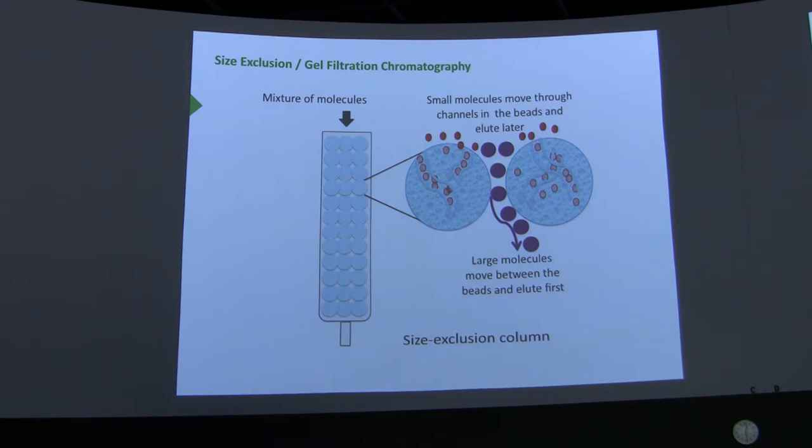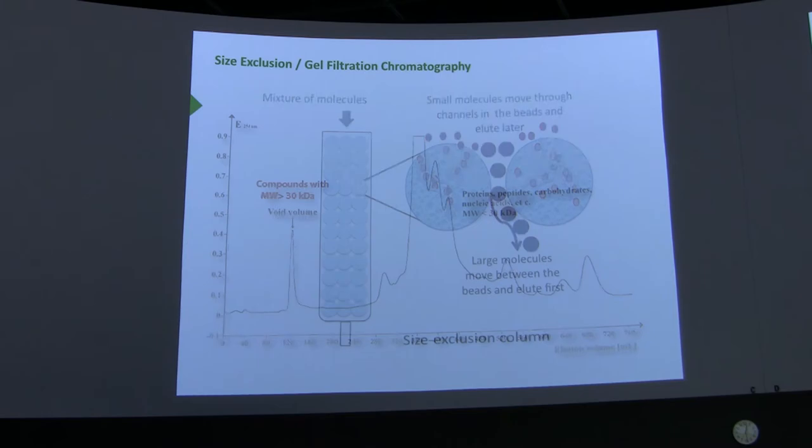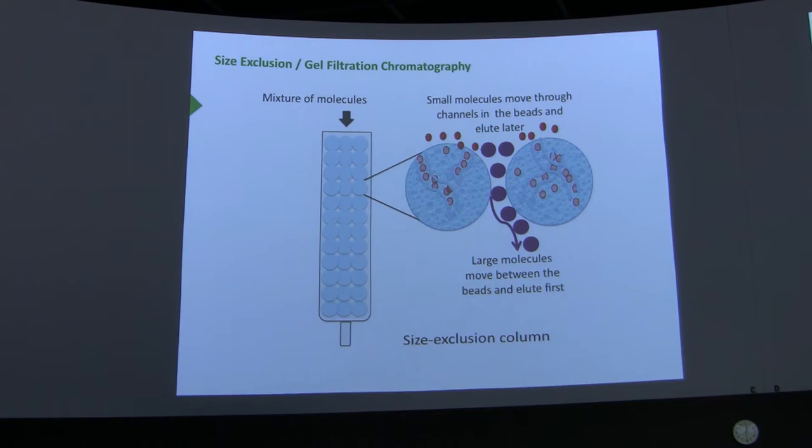All right, they have little tiny openings that come out to the solution so that samples that are dissolved in the buffer can enter those tunnels if they're small enough. Now, the way this technique works is that when we do an isolation this way, we will typically use beads that all have the same sized holes that allow the entry of molecules.